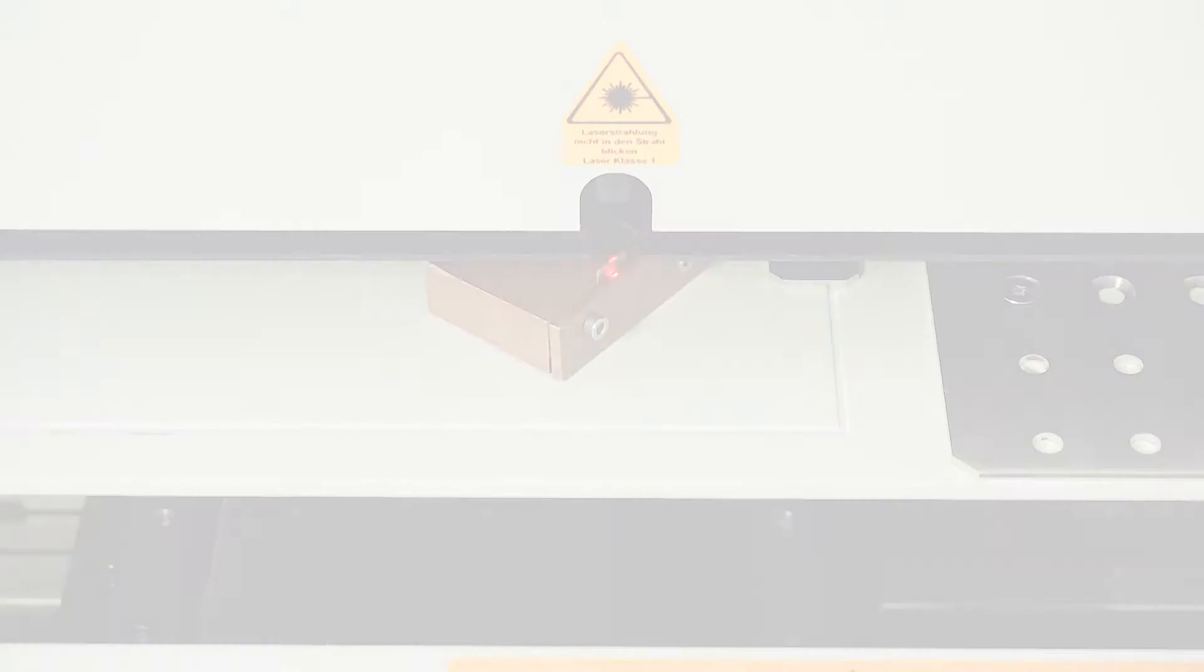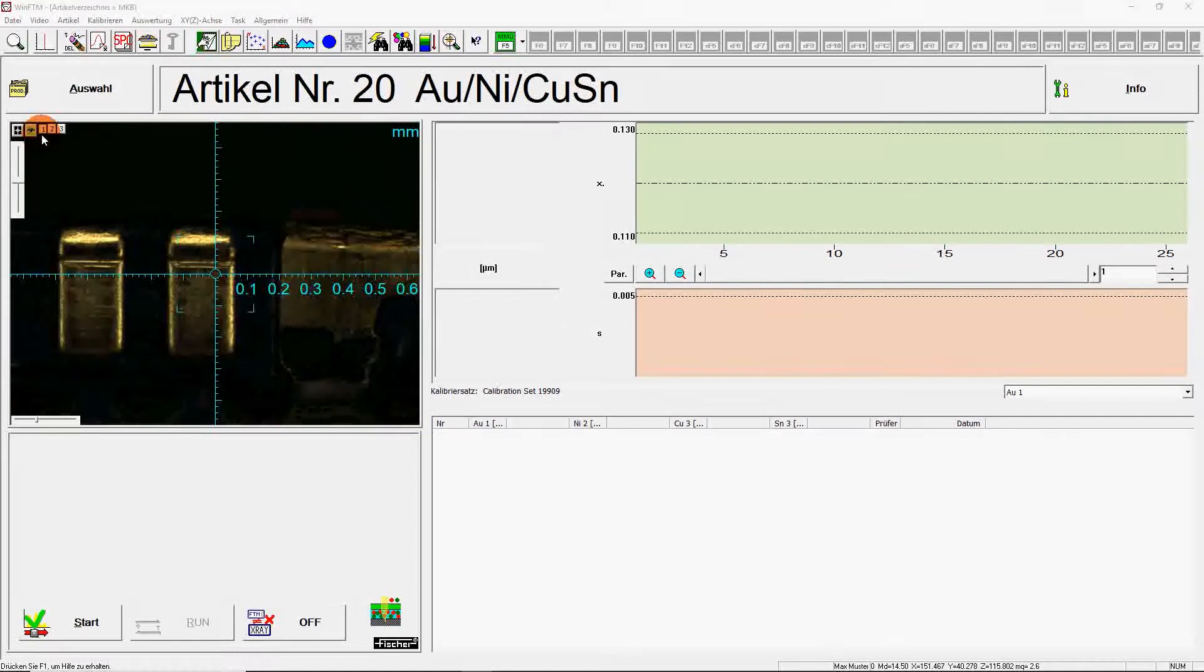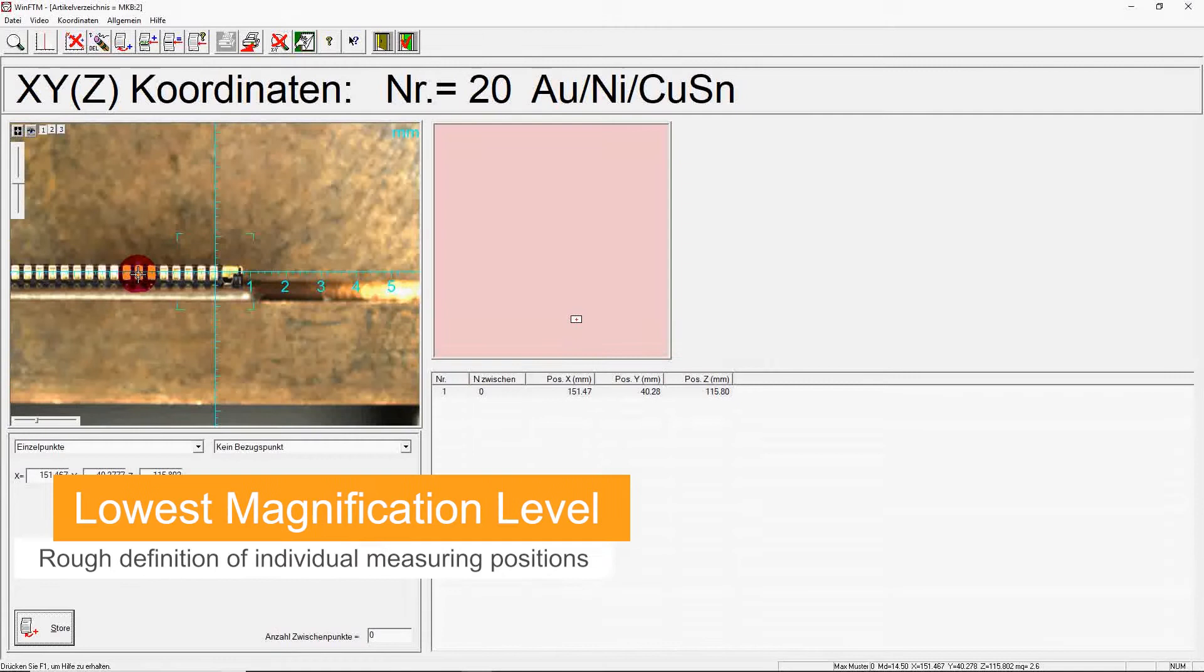The precise approach to the sample is done via video image. At the highest magnification level, the sample is focused using a high precision autofocus. Next, 20 individual measuring positions are roughly specified at the lowest magnification level.